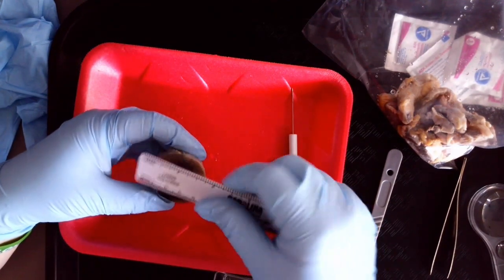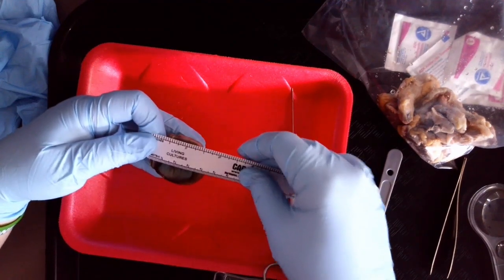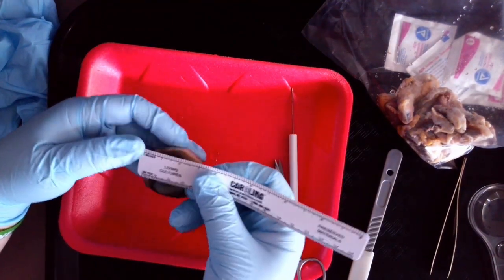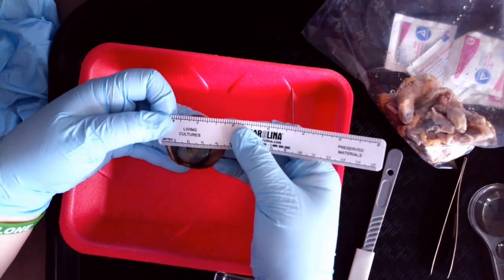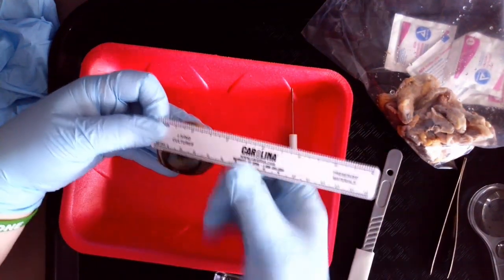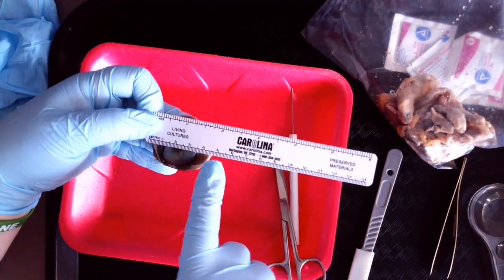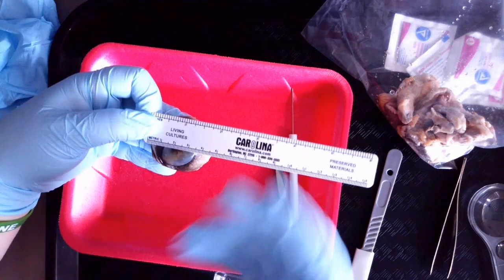I want to go across roughly the center of where the cornea is as best I can. I'm trying to hold this here for people who are doing the virtual dissection so that you can see the measurement. Those of you doing the dissection, you're going to record this measurement in centimeters.